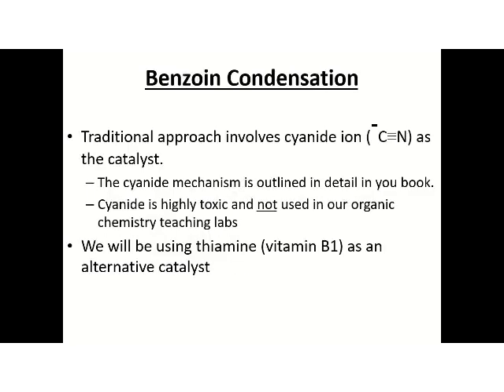So in the benzoin condensation, the traditional approach involved cyanide ions as the catalyst, but the cyanide is highly toxic and is not used in our organic chemistry teaching lab.